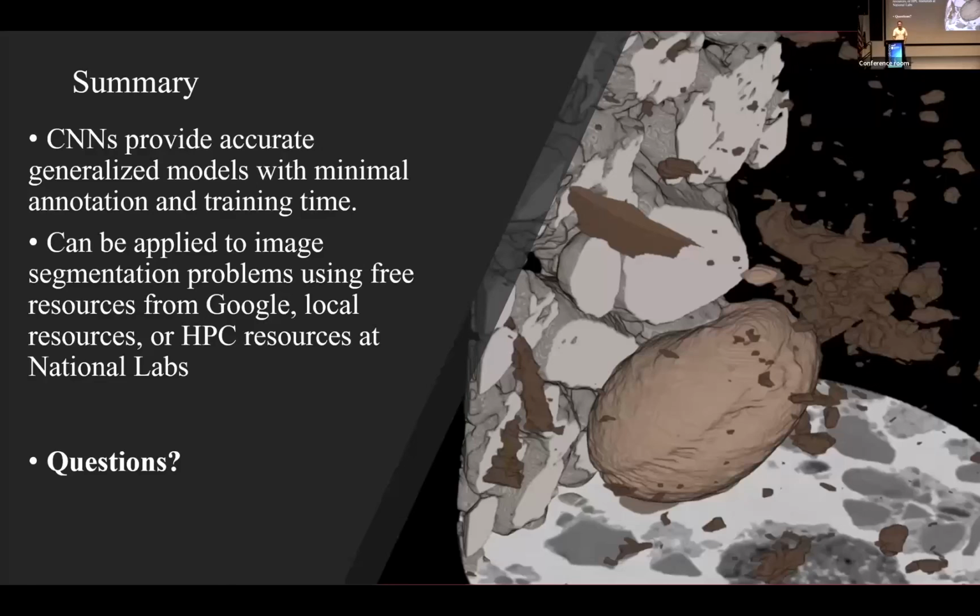Good question. I think that one of the challenges is always, so these images were collected at the Advanced Light Source on Beamline 8.3.2. So getting access to that time is a challenge. In this case, we imaged 3 seeds from pre-fermentation, early fermentation, and late fermentation. And based on that small data set, we see changes in the seed morphology during fermentation.